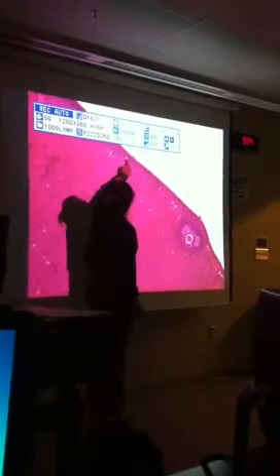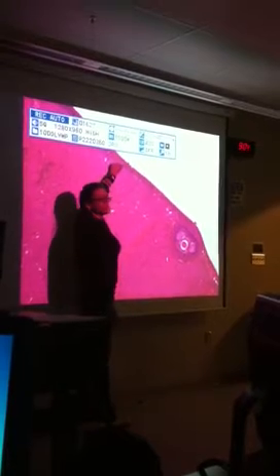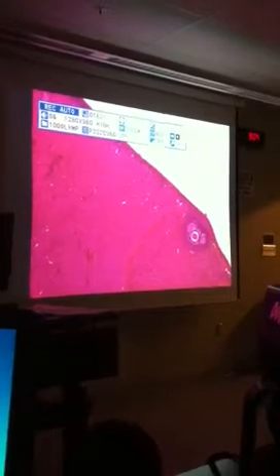But these guys are small follicles, and that little circle in the middle is just a tiny little oocyte that's early in development. This is getting close to the point where it could be ovulated. So that's the ovary. And again, that's going to be best to see at 4x or 10x. You can really look at the outer edge of the ovary.